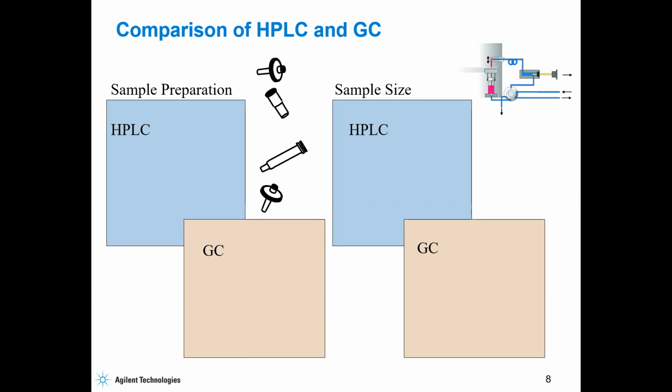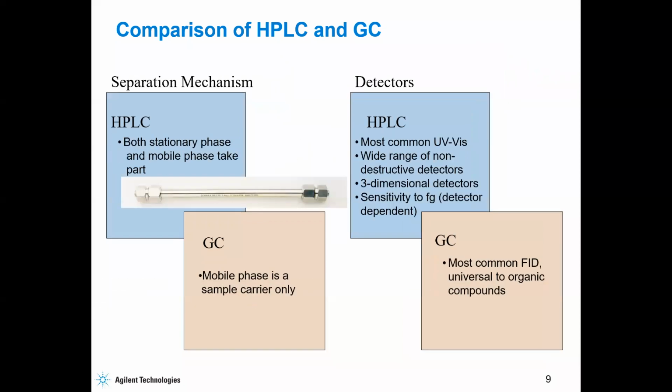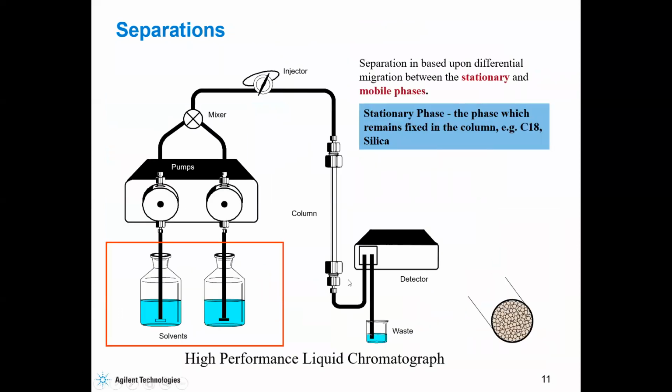You can't recover your sample again when it is destructive. You can't recover it. But with the way HPLC is, I wish I could look at an instrumentation here. So look at what we have on this. This is a slide by Agilent.